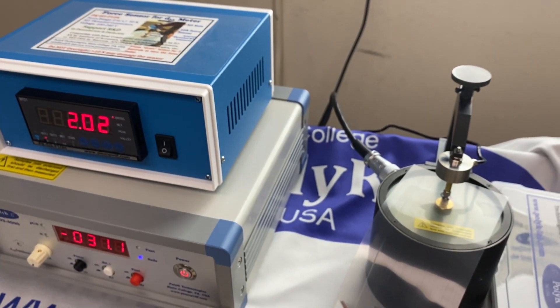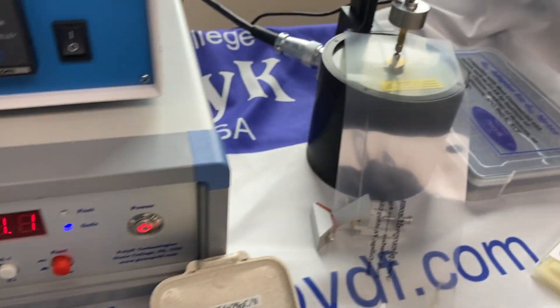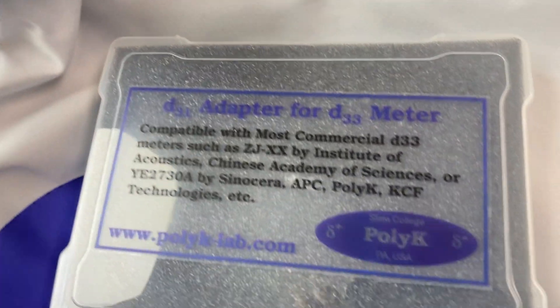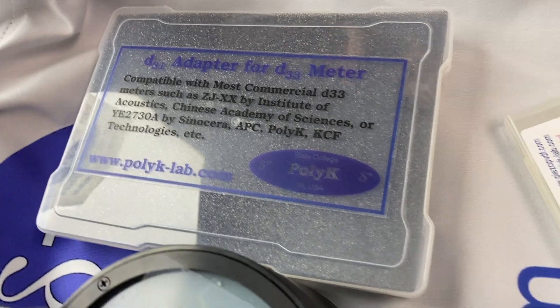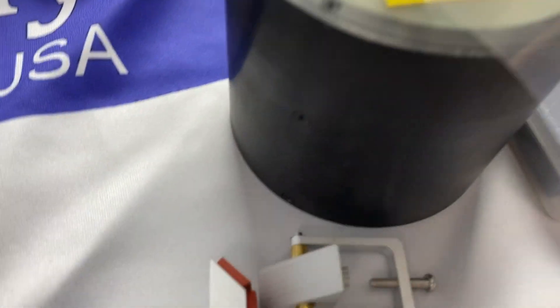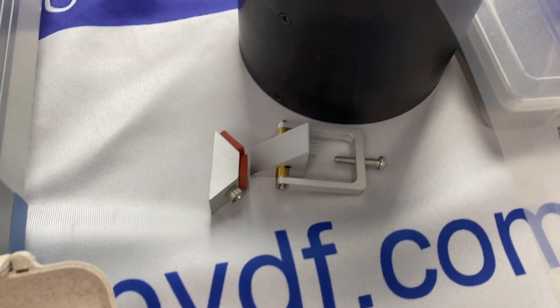So that's how to use the piezoelectric D33 meter. In a few minutes we can also show you how to use the D31 adapter to measure D31 of ceramic — though note it's not a full-field measurement, you can only measure D31 of rigid ceramic. We also have a D15 adapter that can be used to measure the shear mode of piezo ceramic. Thank you.